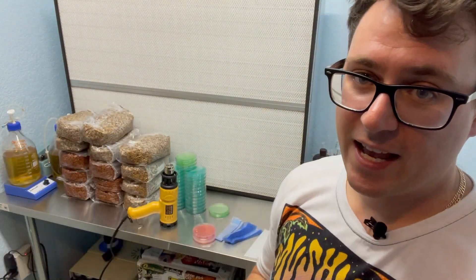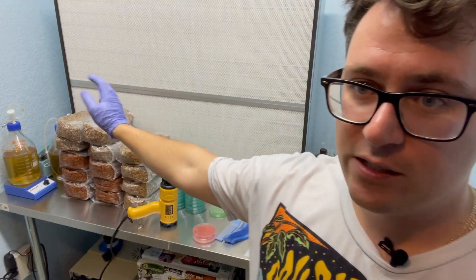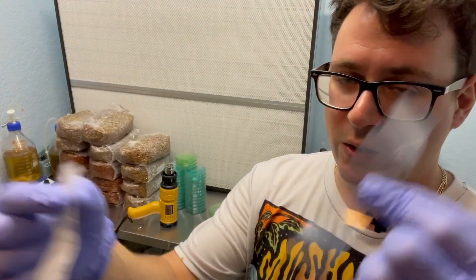Okay guys, I'm going to flip this around and get some lab work going. Try to ignore all these grain bags that I have cooling next to me — I'm going to be inoculating those tomorrow. But the main focus of this video is just parafilm and shrink wrap.